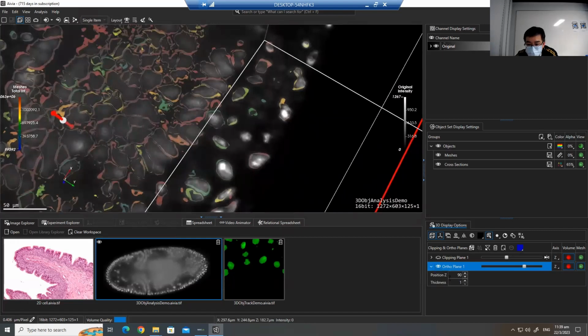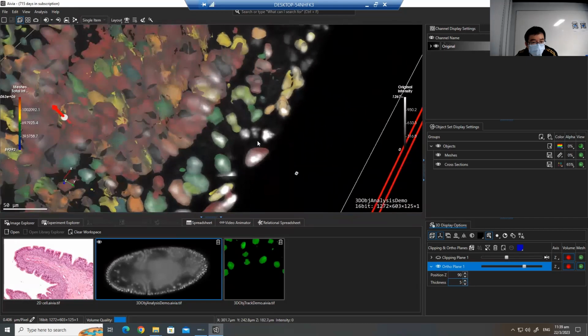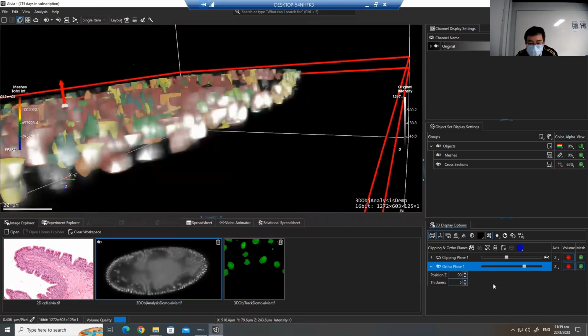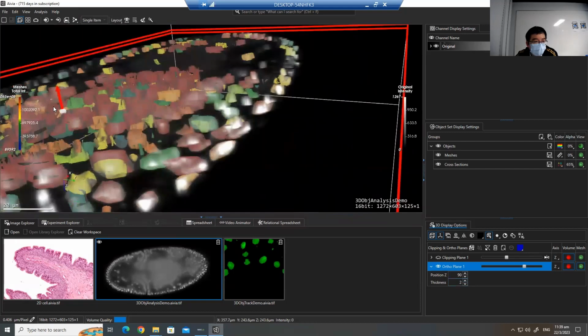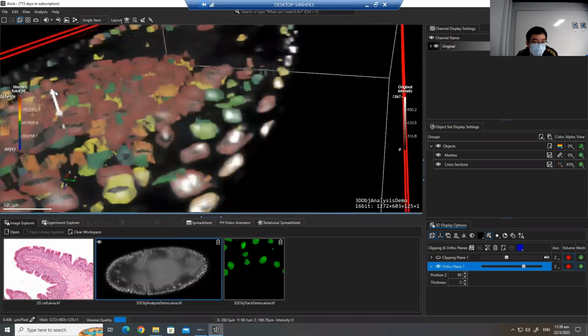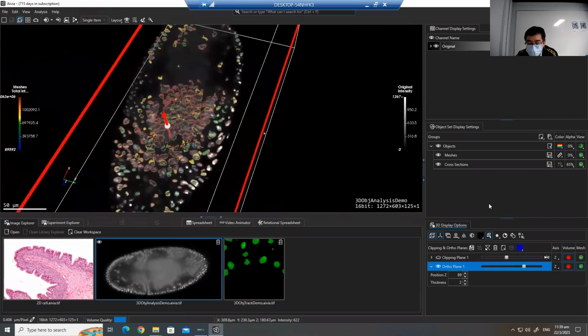In this ortho plane, you can change the thickness of the section. Now 5, and reduce it to, let's say, 2. So you can see a particular layer in here. So this is more about the 3D options once you have generated the 3D model from the result.